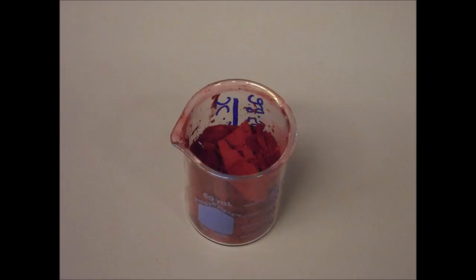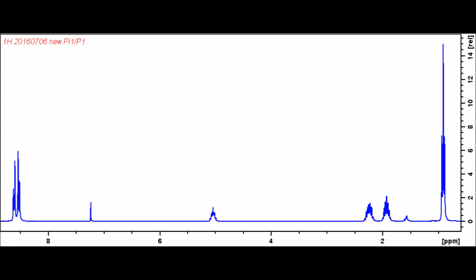To confirm the purity of the compound, we examined the proton NMR and compared it to the literature values. On close examination, we see that the only visible peaks that are not attributed to product are those at 7.2 ppm and 1.5 ppm.